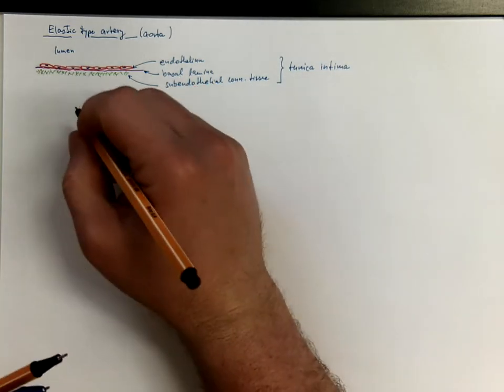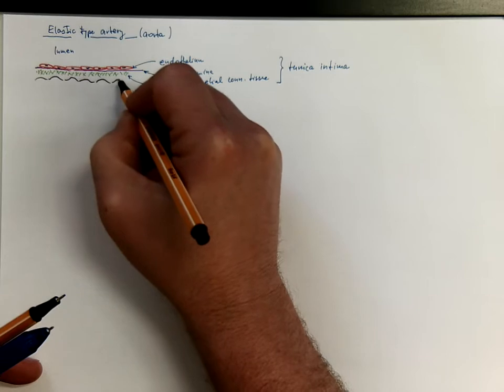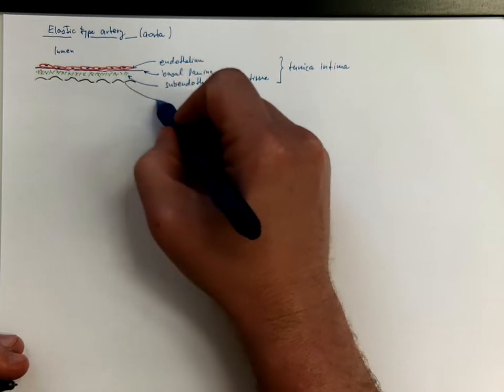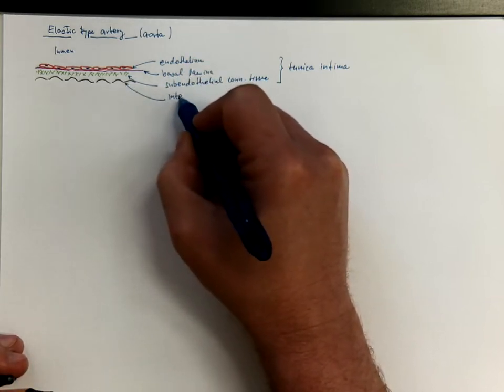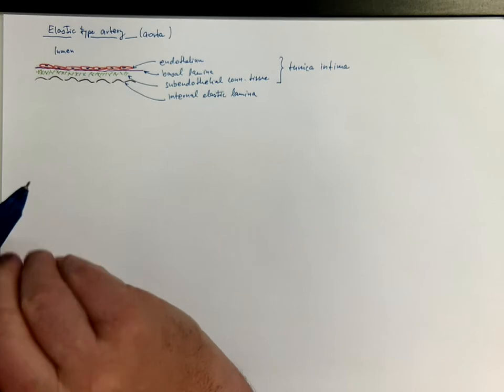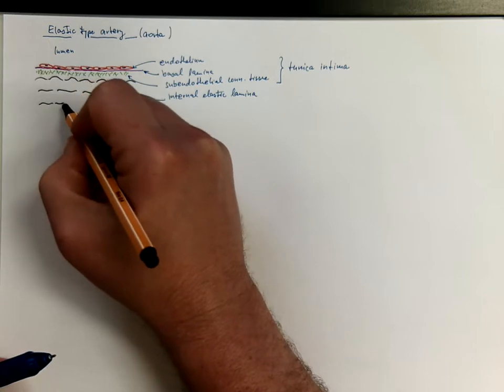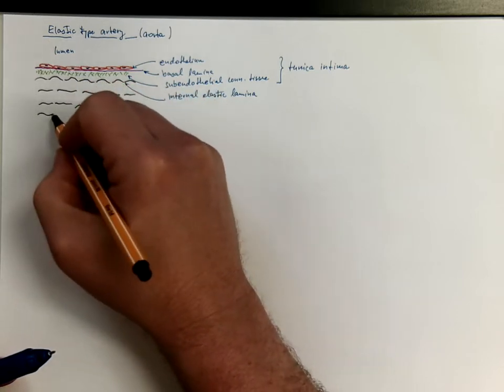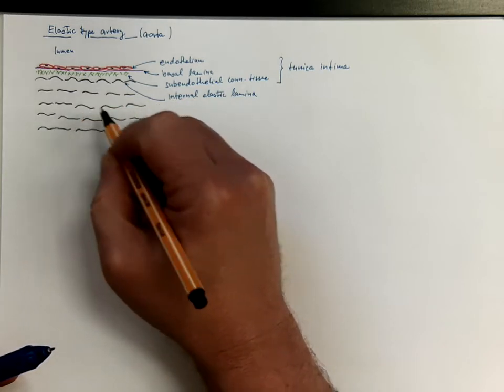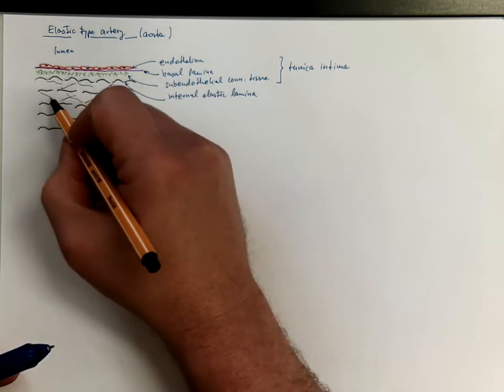The next layer will be the tunica media, the conventional border. Here is the first layer of elastic membrane, which is called the internal elastic lamina. And then we have a whole series of repeating elastic membranes that have openings called fenestrations, even connected with other elastin bridges.